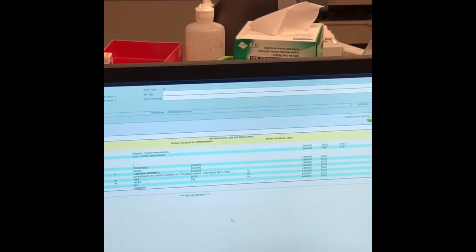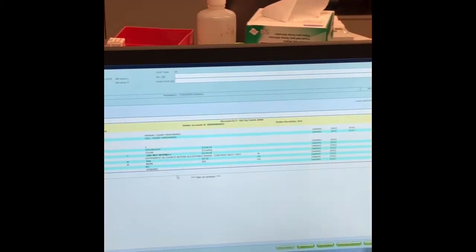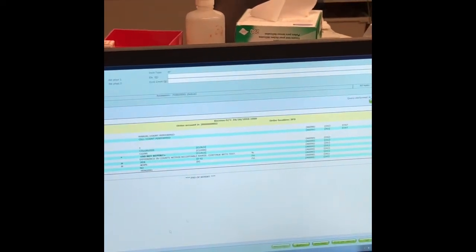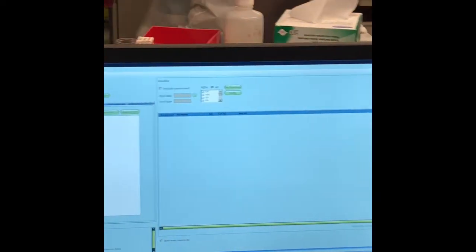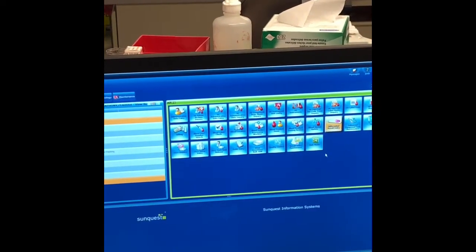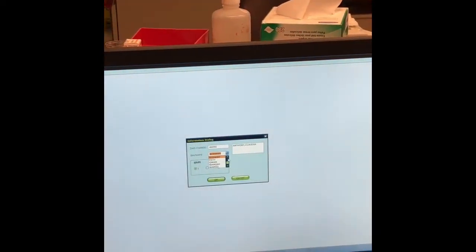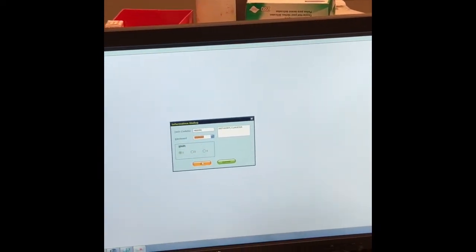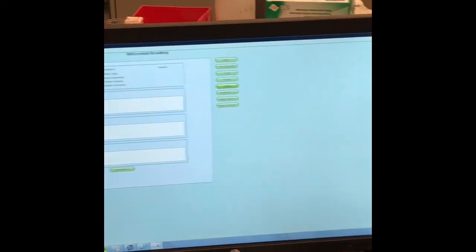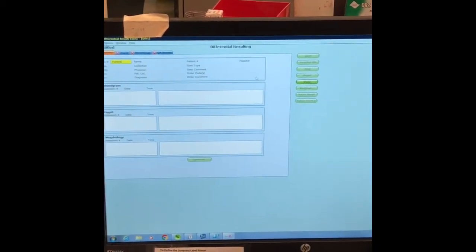So that's what we want to see. Kind of silly, because we ended up putting clear, but the decision ended up being positive. And it's pending. So now, of course, we have to go to GUI, we don't have another choice. Our differential result entry. I think it's this one, and it will be a keyboard that says CSF diff. And again, our number, 591. Yep.